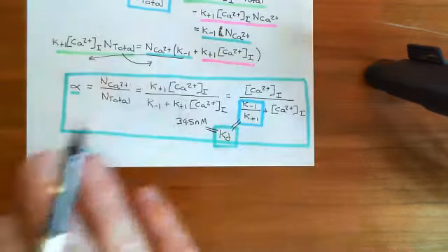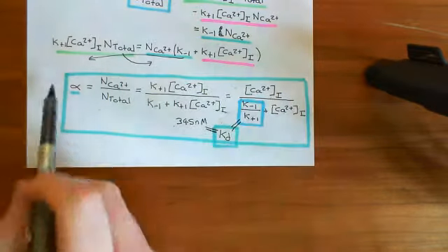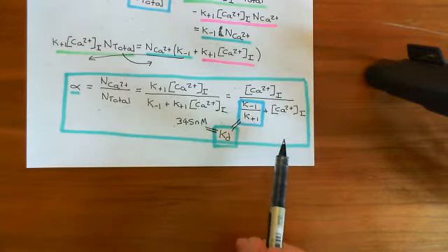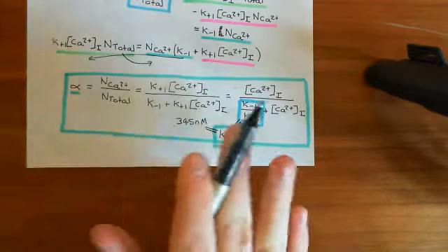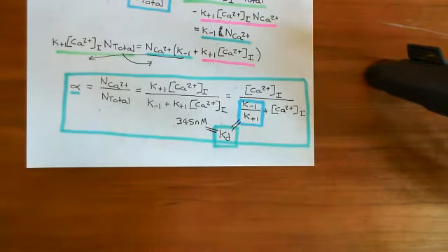But you will never ever load that sort of number of Fluo-4 molecules into the cell. So always the number of Fluo-4 molecules will be tiny compared to the number of calcium ions, and this formula then holds true.